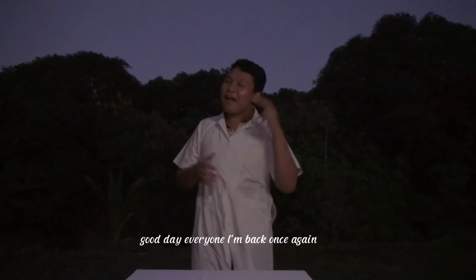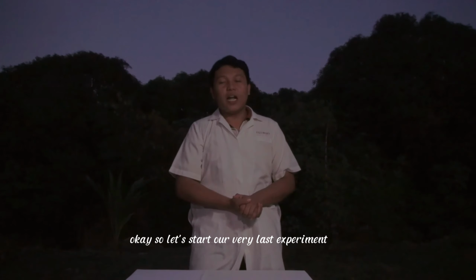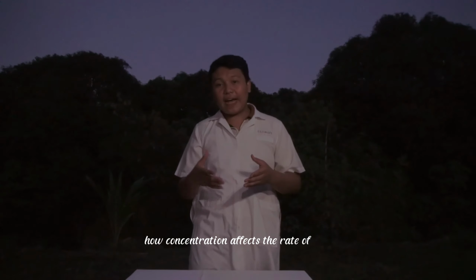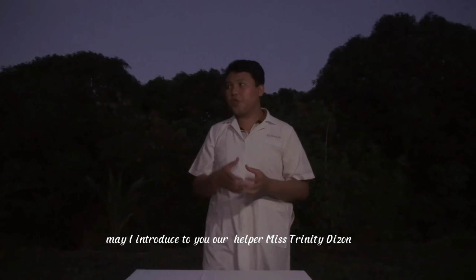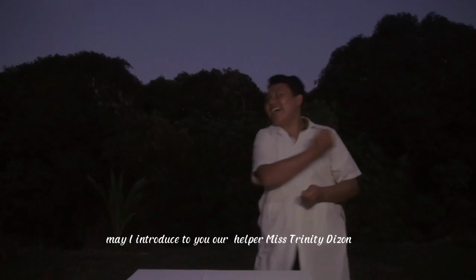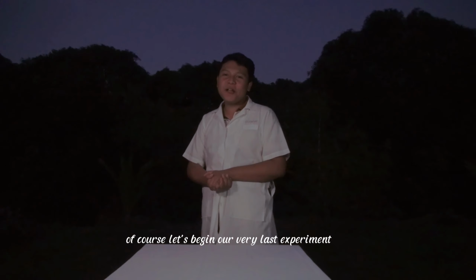Good day, everyone. I'm back once again. It's getting gloomy, right? Okay, so let's start our very last experiment. This experiment will show how concentration affects the rate of chemical reactions. So let's start. Before we start, may I introduce to you our helper, Miss Trinity Dizon. Yes, of course. Without any further ado, let's start our very last experiment.